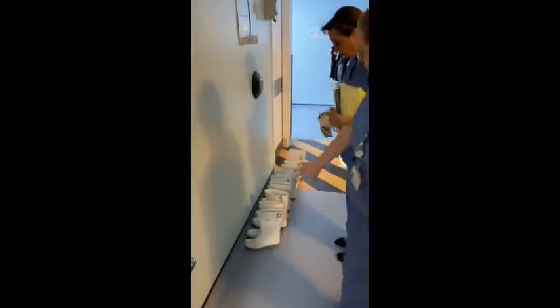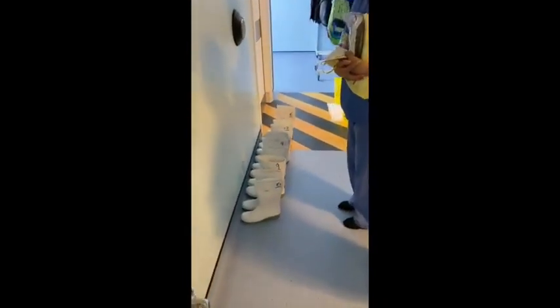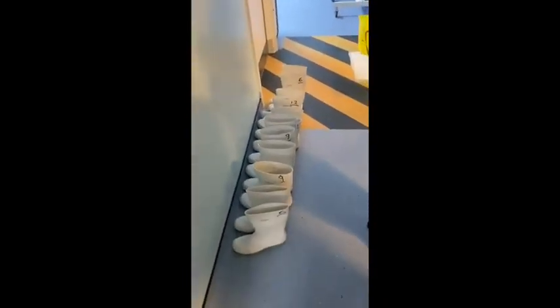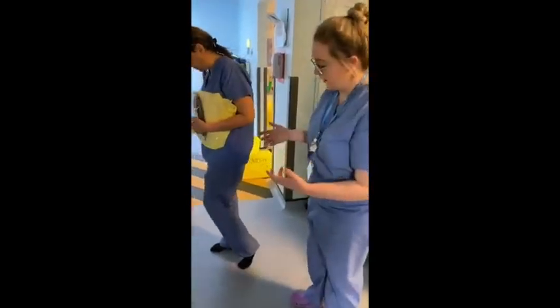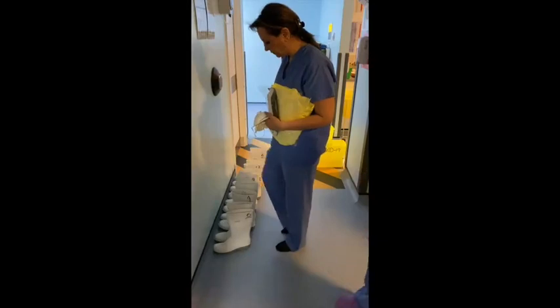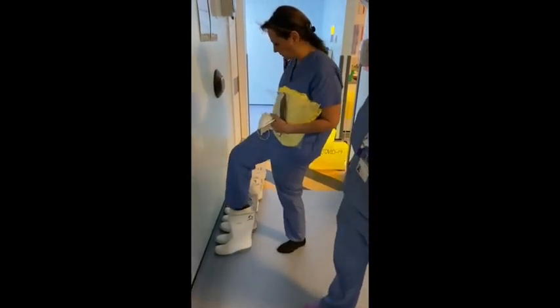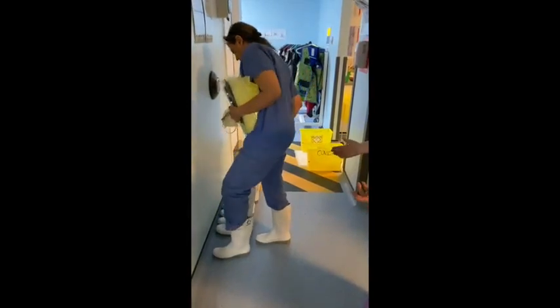There's going to be some Wellingtons on this wall. The only sizes we have are size 6, 9 and 12, okay? We have written on them, so you shouldn't have to pick up or touch the Wellingtons at all. Now, to put on the wellies, your trousers, because they're tucked into your socks, should not bulk up. So you should be able to slip your foot into your Wellington without touching it, as Ghada has just demonstrated.